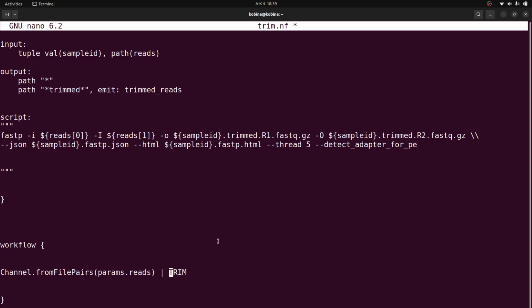All right, so once we do this, what we can do now is exit and save changes.